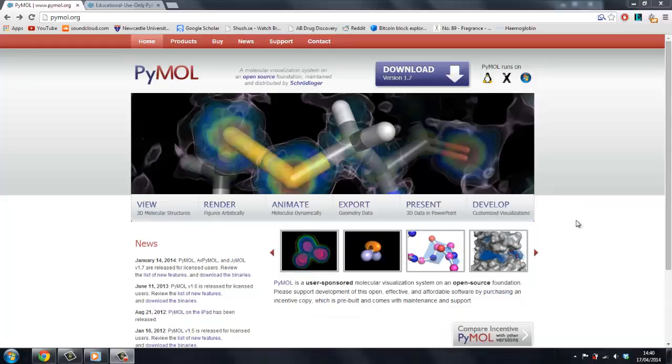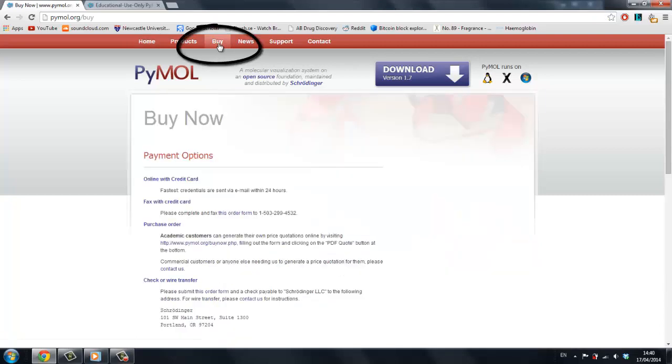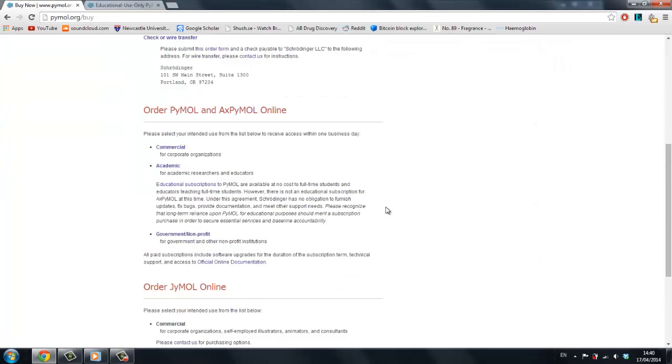We first want to download an educational copy of PyMOL. Go to PyMOL.org, then the Buy section and select Educational Use Only.